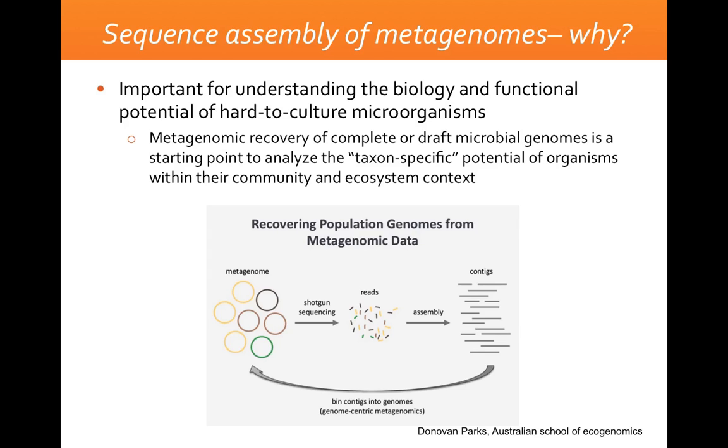I think that is one of the most important arguments for doing complete genome sequencing. And of course, you will get other types of information than you would with only 16S amplicon sequencing. You can dig more into the functional parts of this community that you are sequencing, but that will be covered in a later talk.